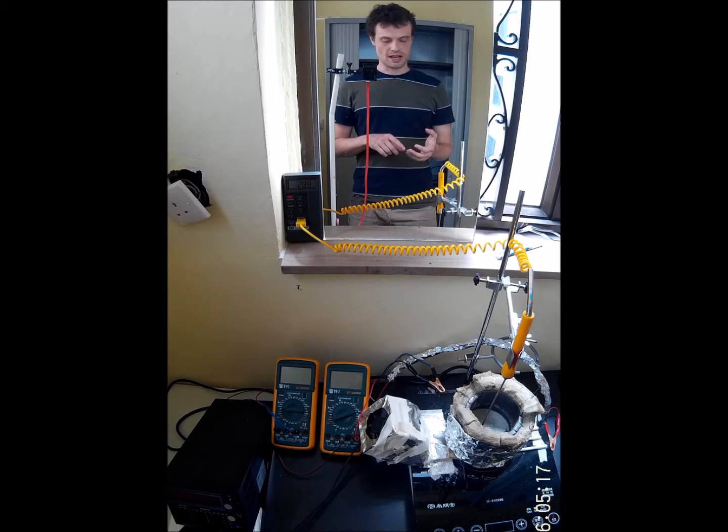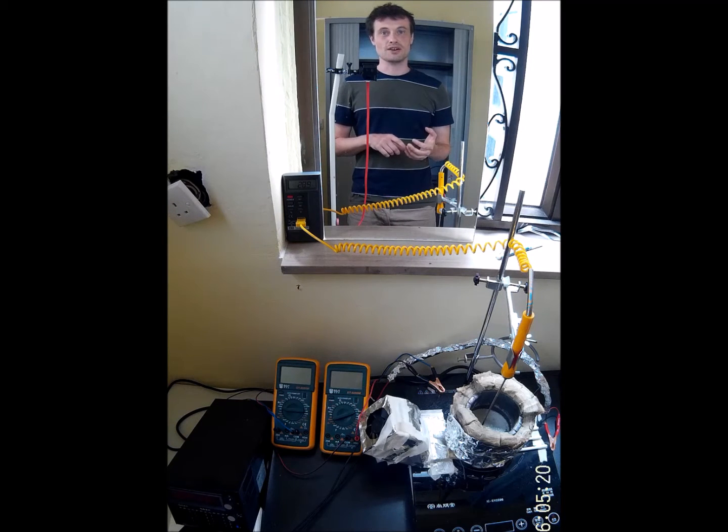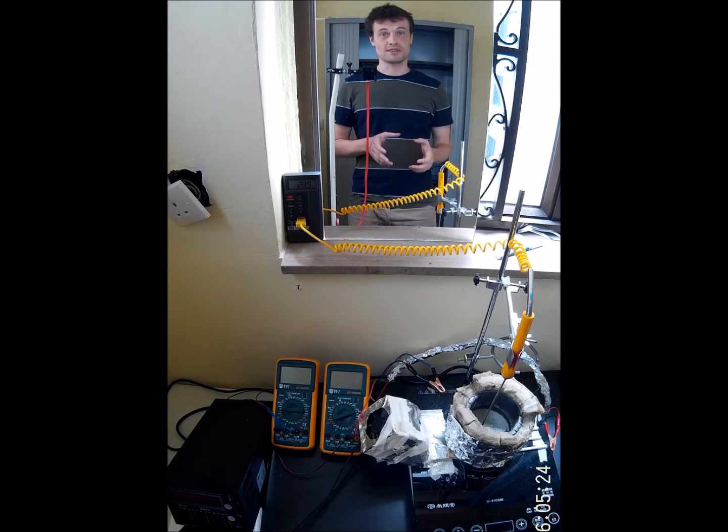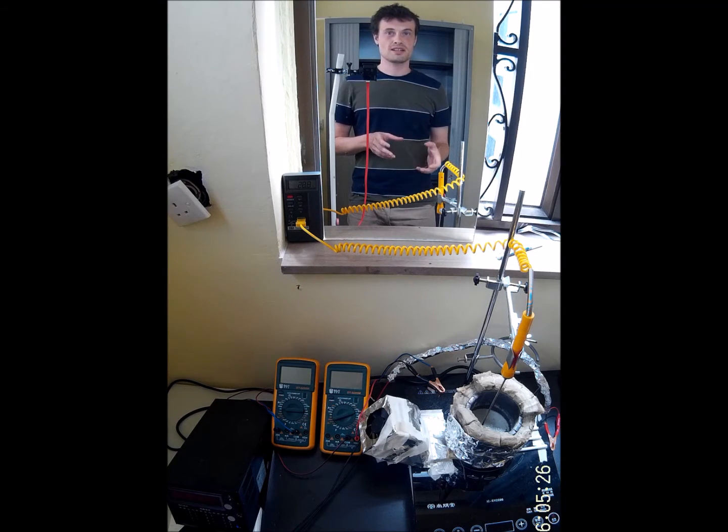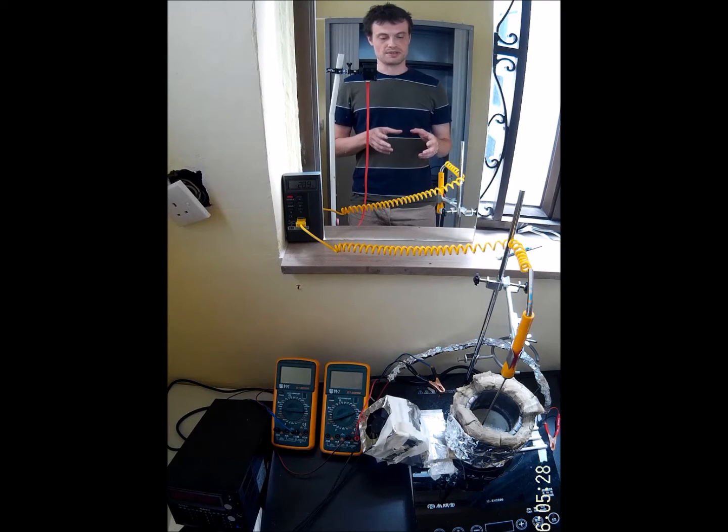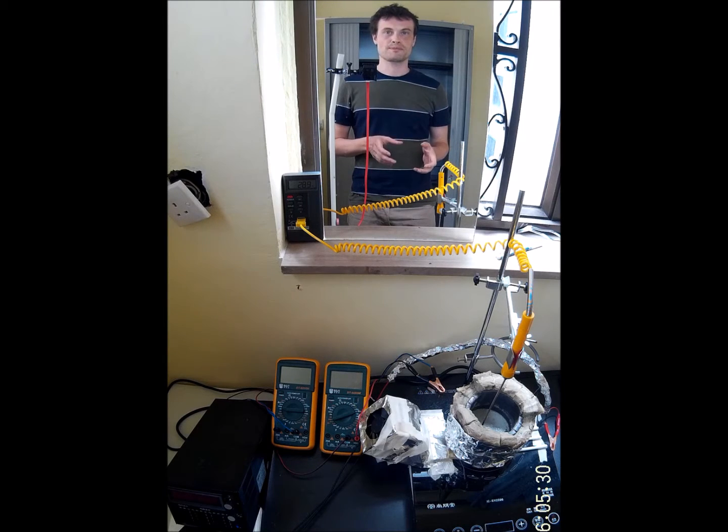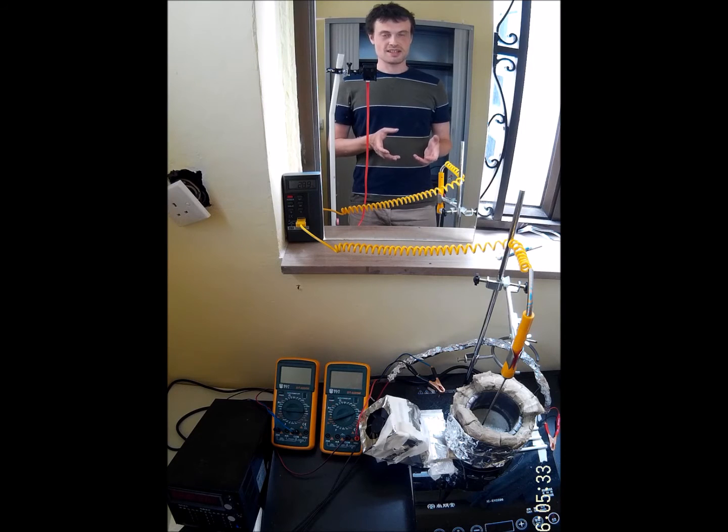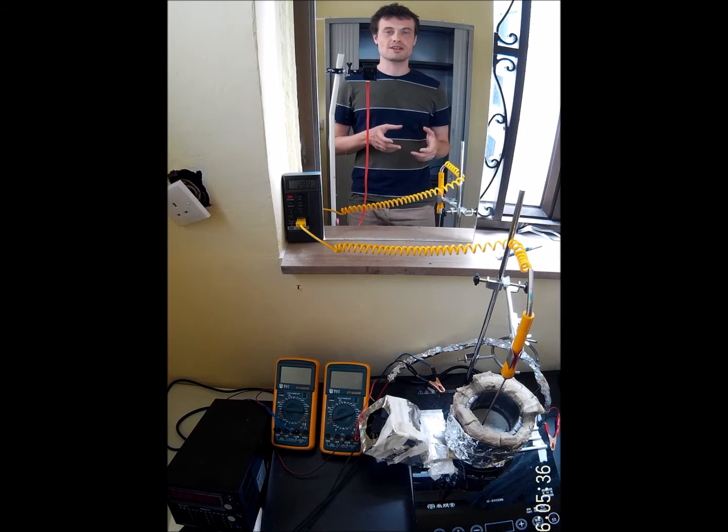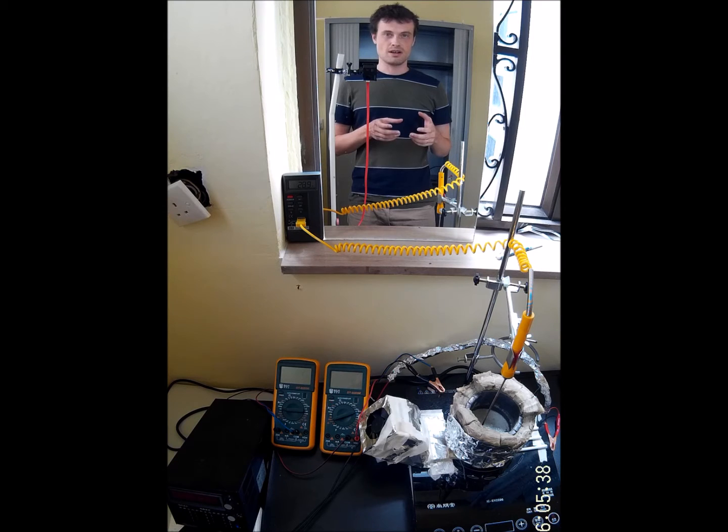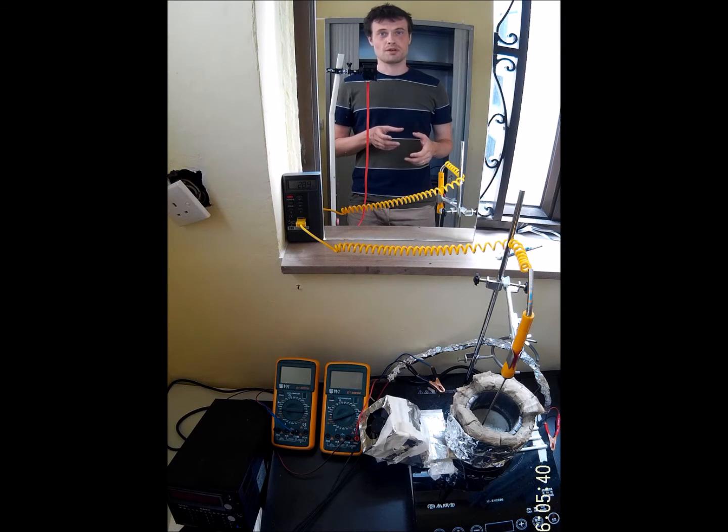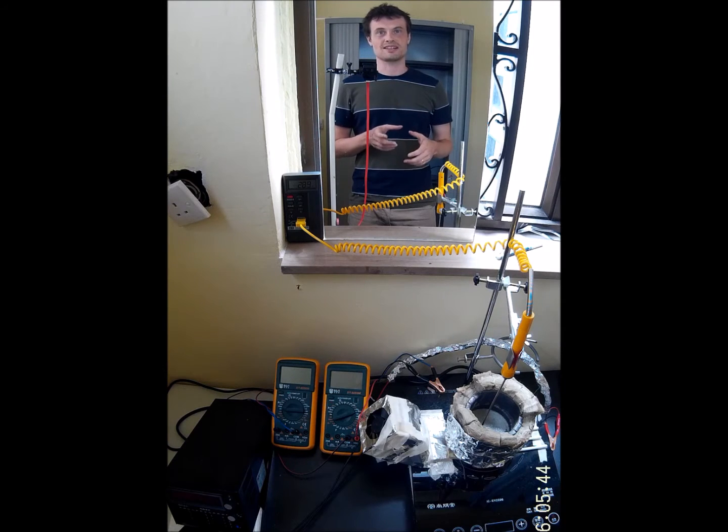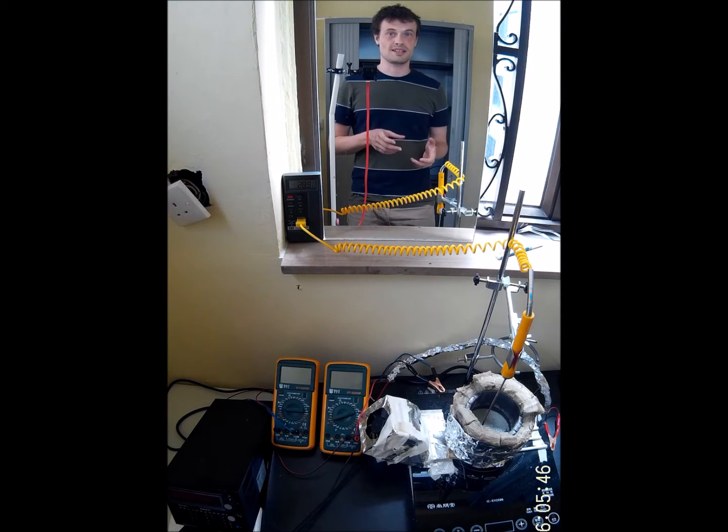Now the oxygen will bubble out near the anode, the carbon will get stuck on the cathode, and the lithium oxide will stay with the molten lithium carbonate. Lithium oxide is able to capture carbon dioxide from the air and that will turn it back to lithium carbonate.